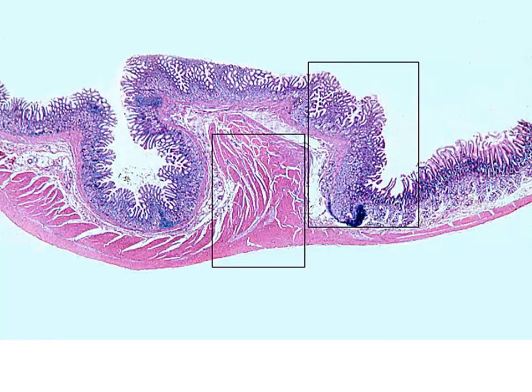Now, as we get to the end of the stomach, this is where we're going to transition from our gastric glandular epithelium, which we see on the left. We've got our gastric pits, gastric glands, and we can see the muscularis externa is extremely enlarged in this region, and that is going to extend up and be part of our pyloric sphincter.